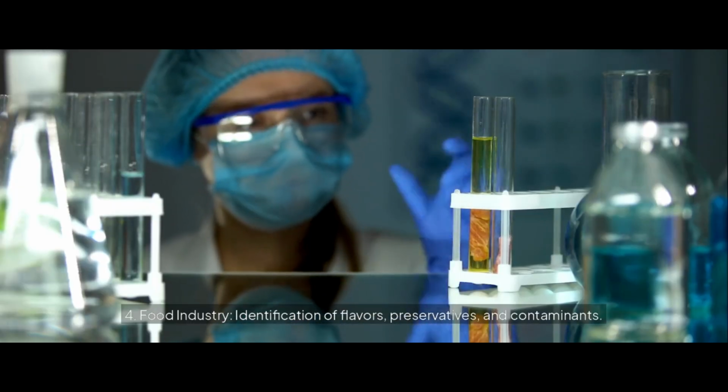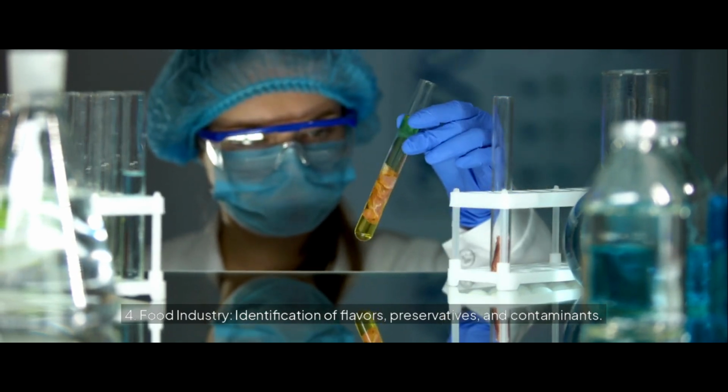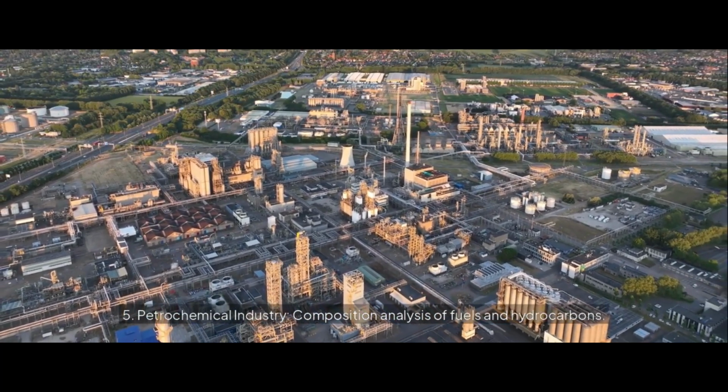4. Food industry, identification of flavors, preservatives, and contaminants. 5. Petrochemical industry, composition analysis of fuels and hydrocarbons.